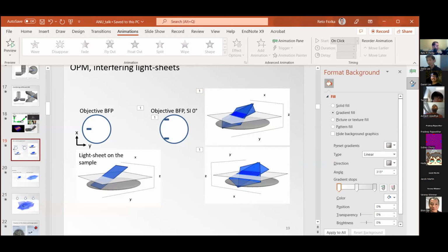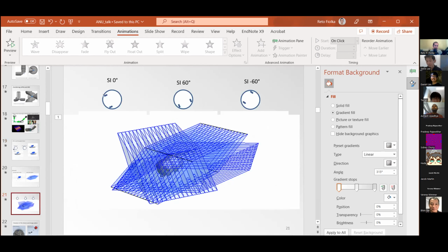But if you wanted to make more complicated patterns, then yes, an SLM would be preferable. One could maybe even try to produce some type of optical lattices. In a similar way to the lattice light sheet, you could use an SLM that shapes the illumination beams, and you somehow have to offset them, since the lattice would have its order centered, so you have to shift them to the side. But that you can in principle do with some mirrors, because once they are at the edge or wherever you want them, and the image rotator is correctly oriented, then it will just rotate them. That's the beauty: if you have them where you want them and everything is correctly aligned, it just rotates them. If it's not correctly aligned, maybe one of your orders will jump over the edge and disappear.